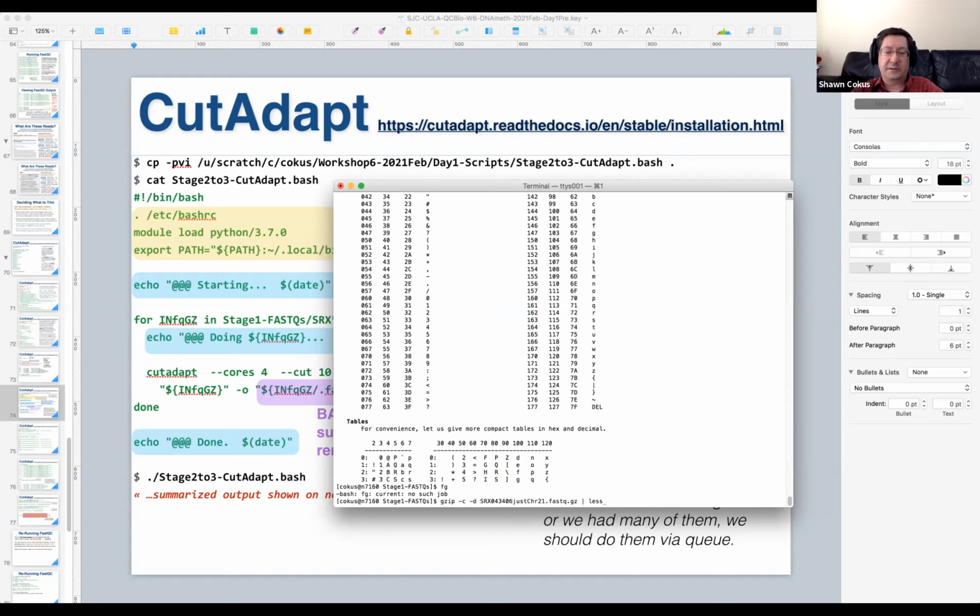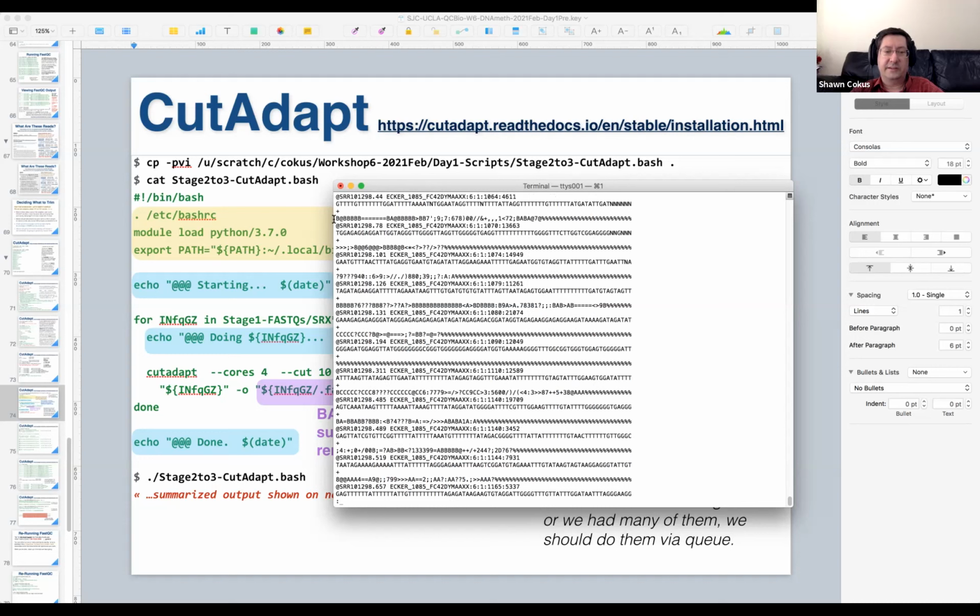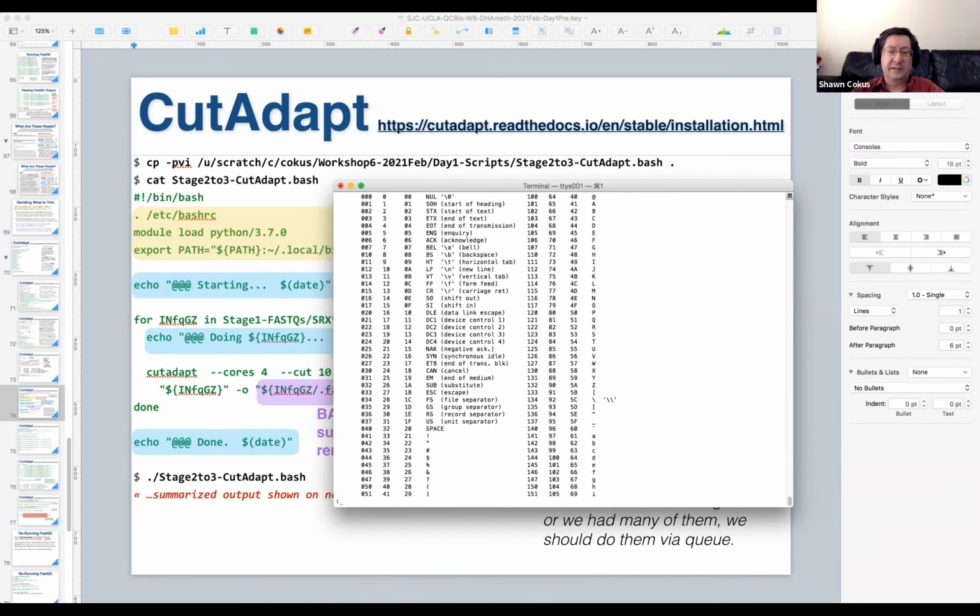Oops, I lost where we were. There we go. Let's get back to our read. So anyway, so this is our read. Actually, there's two quality score encodings. There's the 33 shift and the 64 shift. Anyway, what do we got here? We got some capital Bs. Which shift are we dealing with in this one?